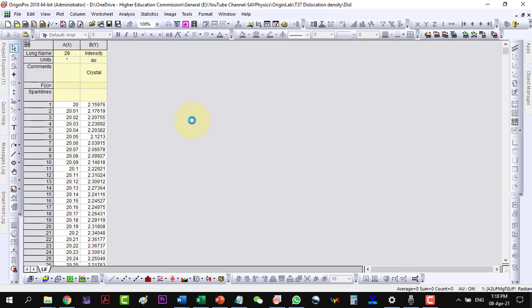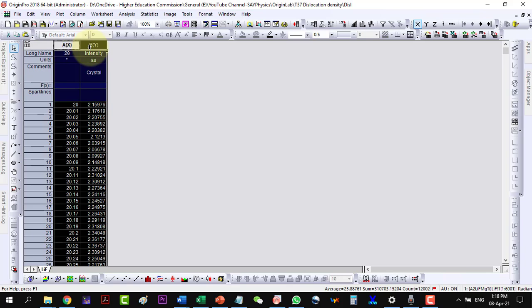This is the XRD data file of LiF. Let me plot this data.